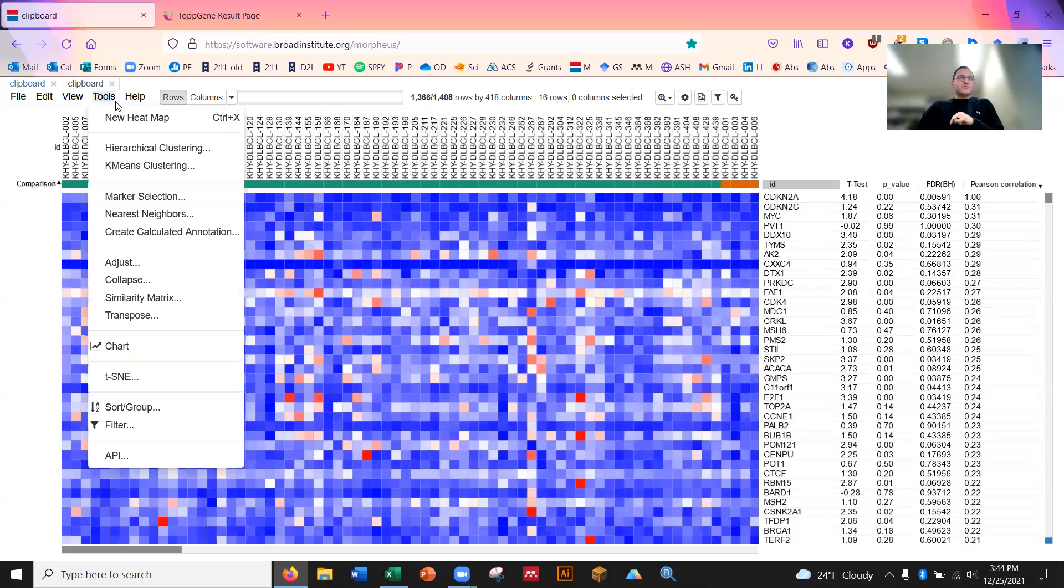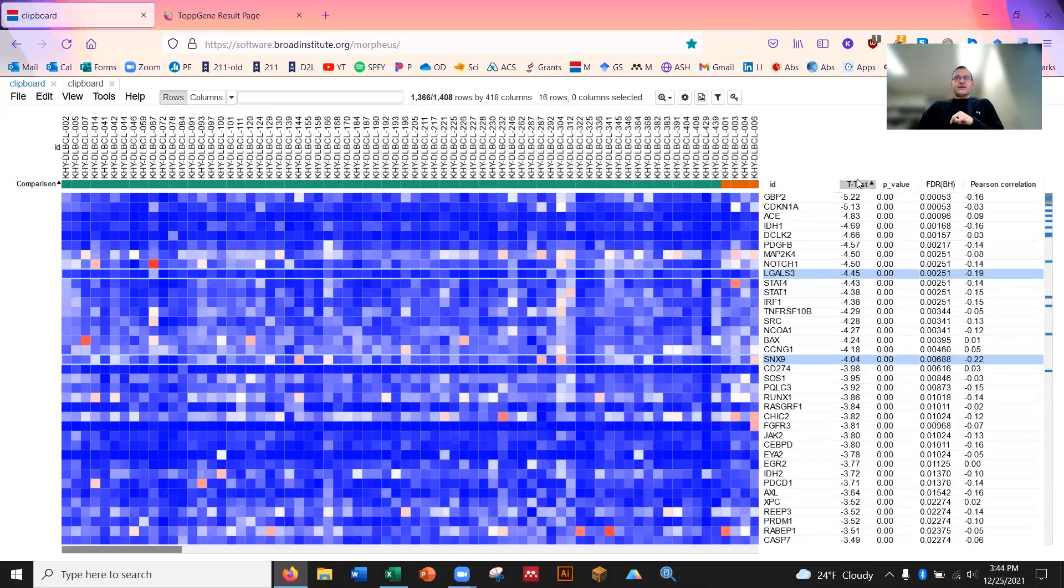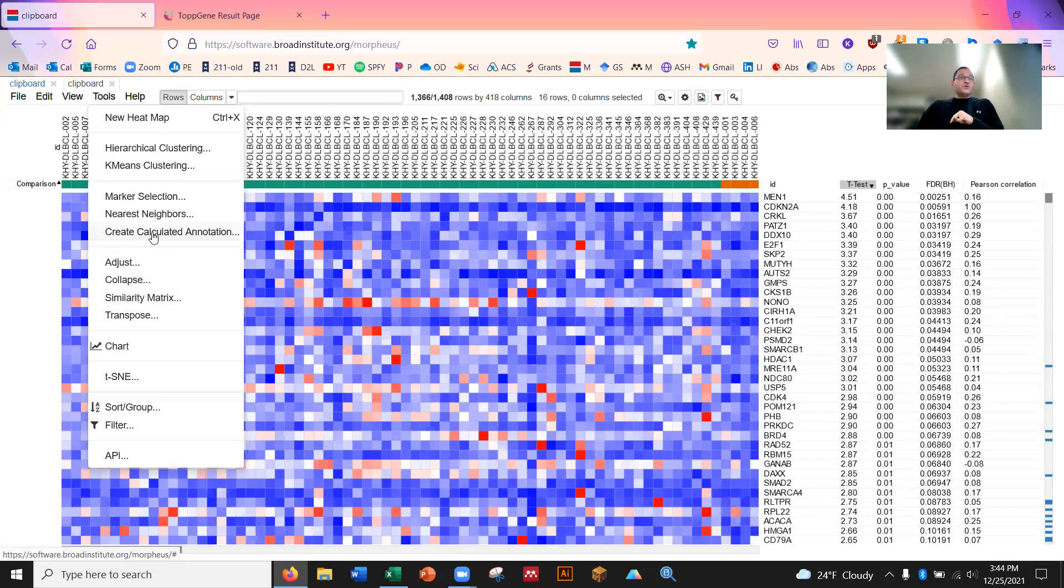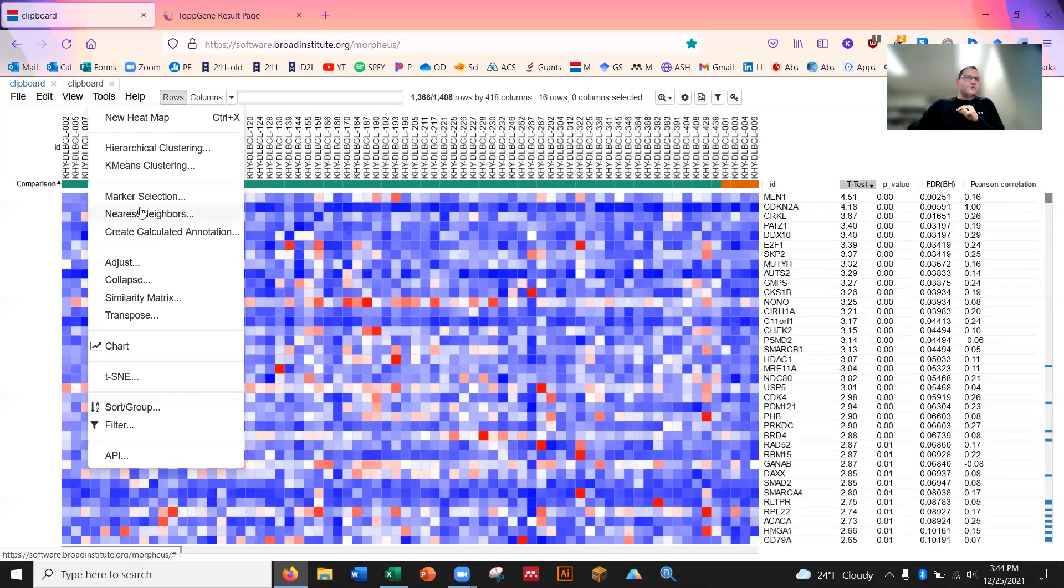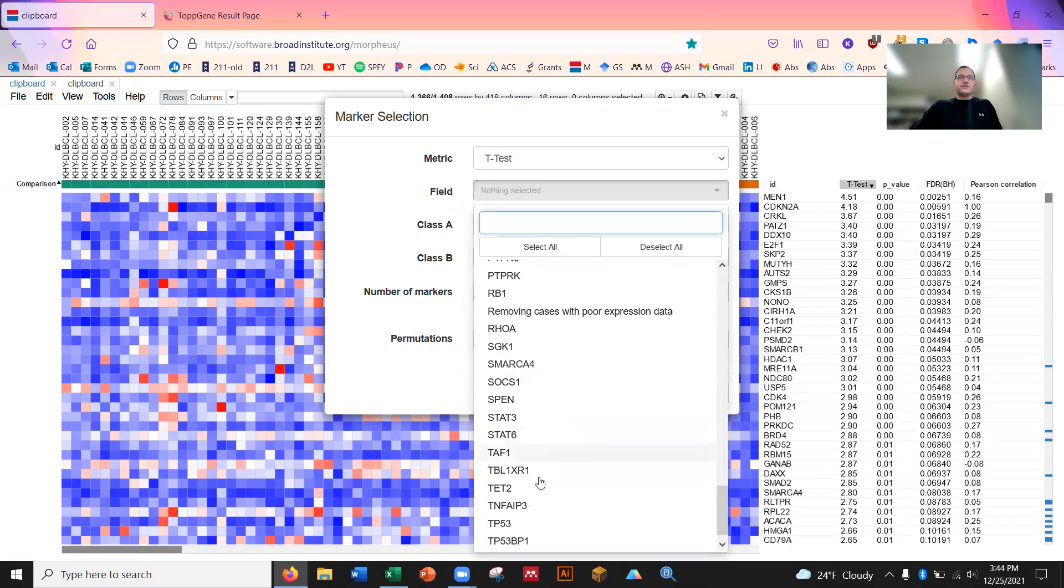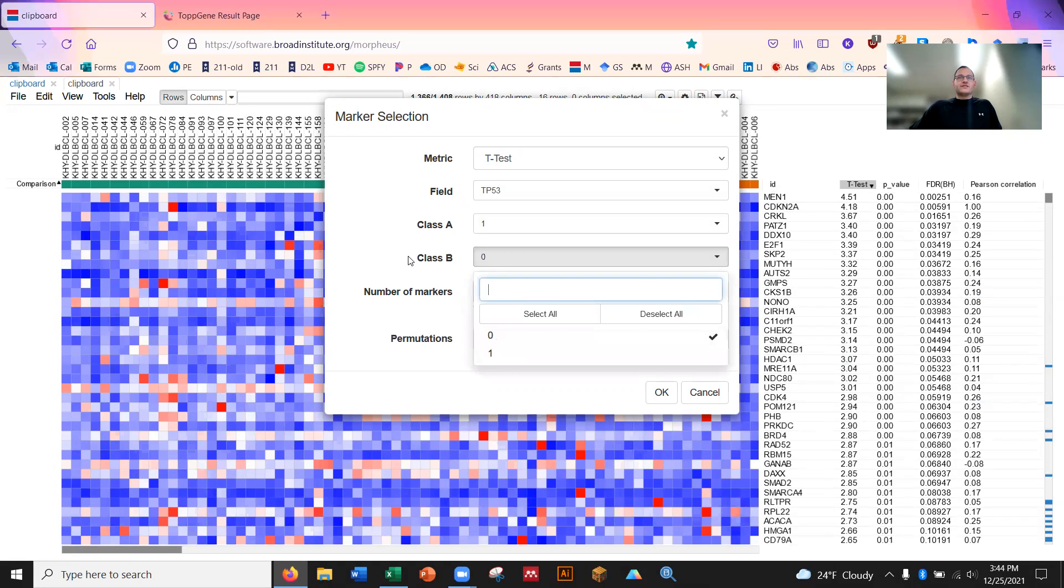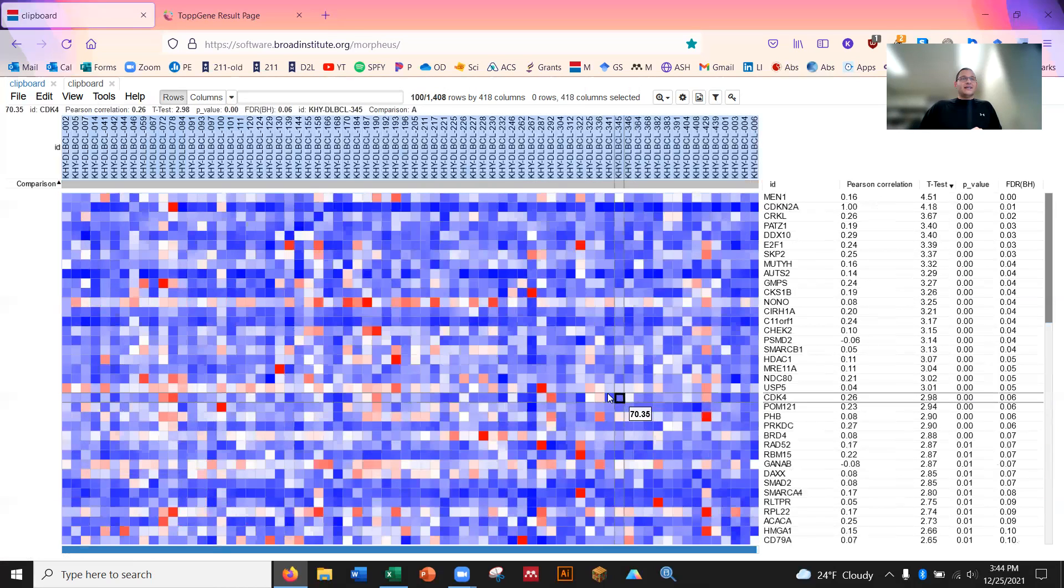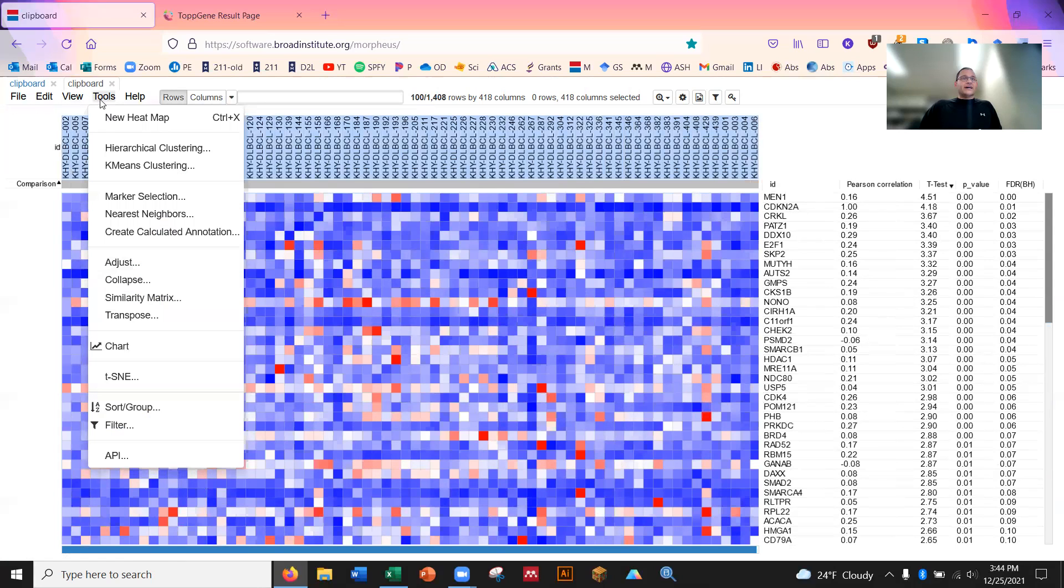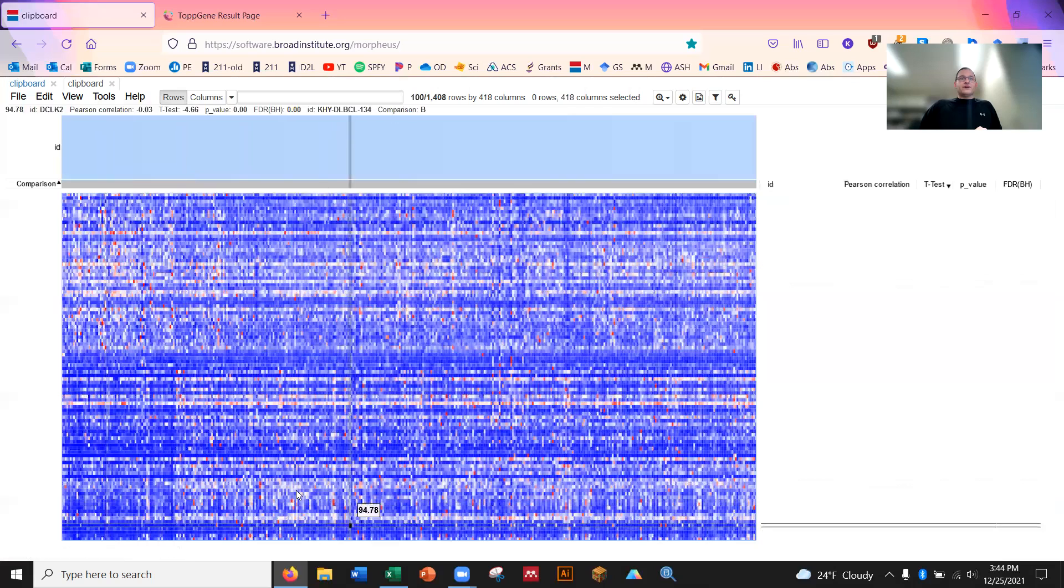You can get the data kind of rolling up kind of like this too. One cool way is you can actually make really nice looking heat maps. So I'll be honest, at this point in the video, this is more like blue text. If you guys know me in class, this is helpful, but you won't do this as much. So keep watching if you're interested, but you've hit the main points at this stage. So what I would probably do here is actually run another marker analysis, get a new sheet. And we'll put in the same parameters as last time, except this time I am only going to analyze 50 genes this time. So this one's going to be a lot cleaner and more fun to look at. So go to view and then fit everything to the window. Now you can kind of see how this is a lot more like red and then blue. Like we've really selected really good genes that are high in P53 and low in P53, as opposed to when that gene is not having an issue.